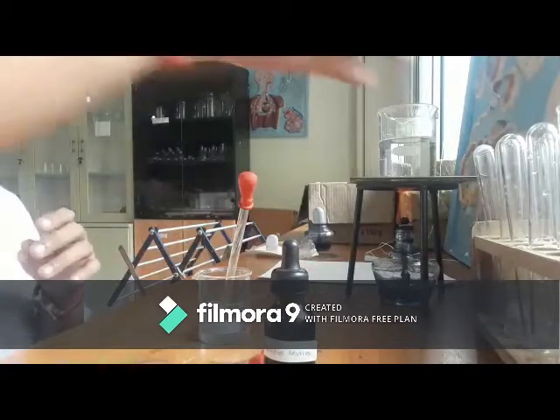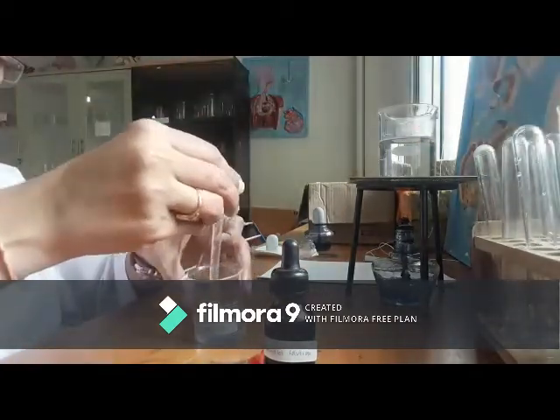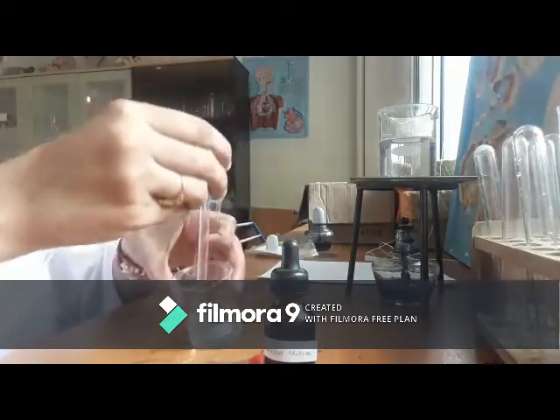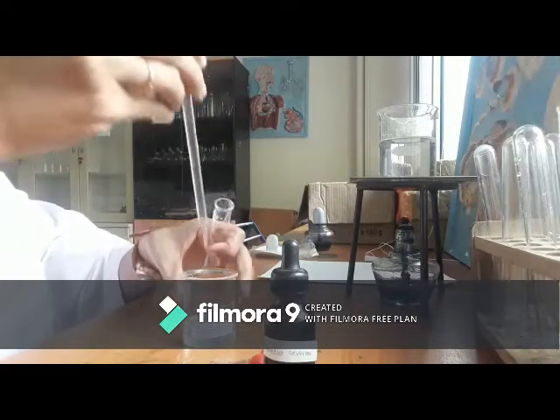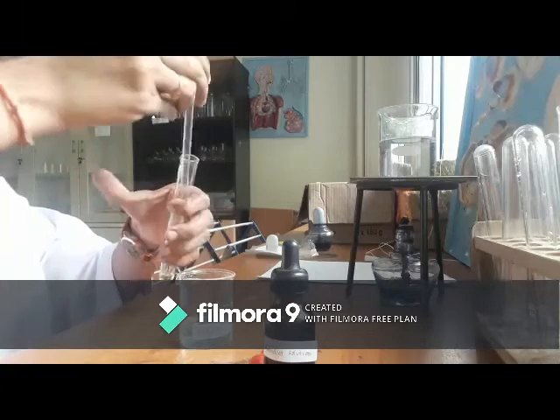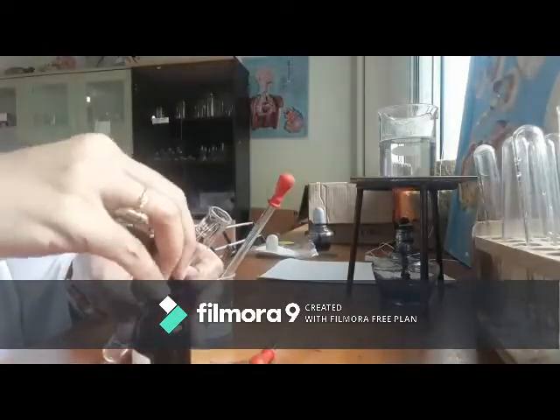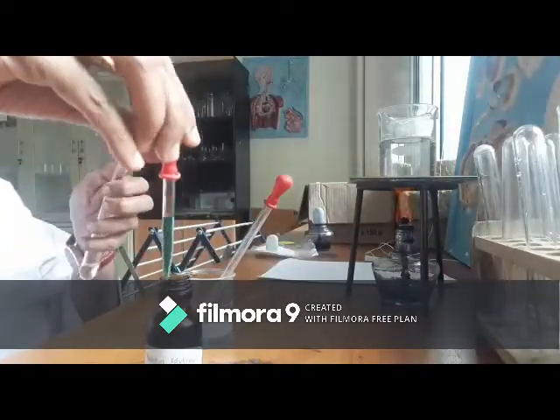The third test is Benedict's test. It's for reducing sugar. Take about 5 ml of sugar solution and then add 5 ml of Benedict's reagent. Shake it and boil the mixture. You need to wait until the mixture changes in color.